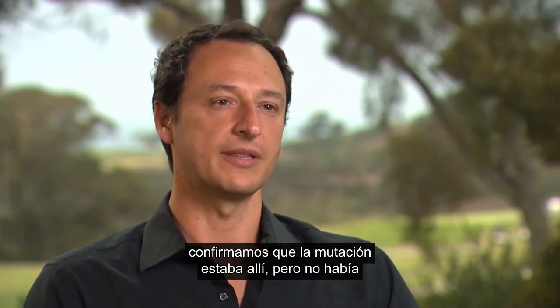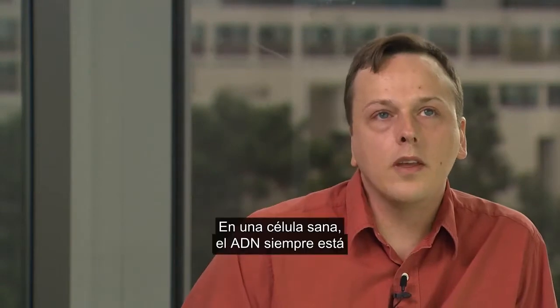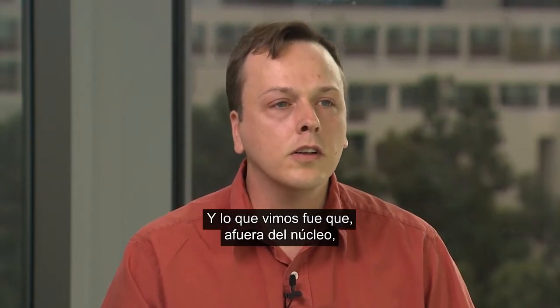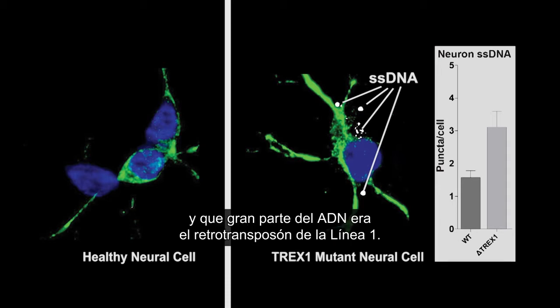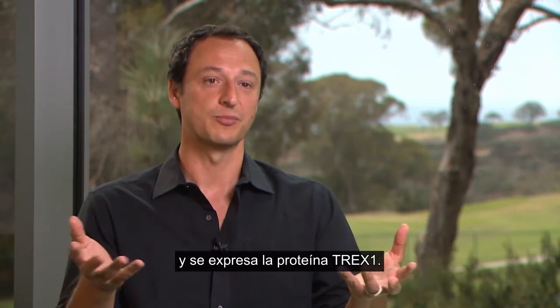When we engineered these cells, we confirmed that the mutation is there, that there was no TREX1 protein inside those cells. In a healthy cell, you always have your DNA in the nucleus where it's supposed to be. What we saw is that outside of the nucleus, to an extreme amount, there was single-stranded DNA. And a lot of this DNA was actually the LINE-1 retrotransposon element. The control cells behave like normal cells, with the TREX1 protein being expressed.